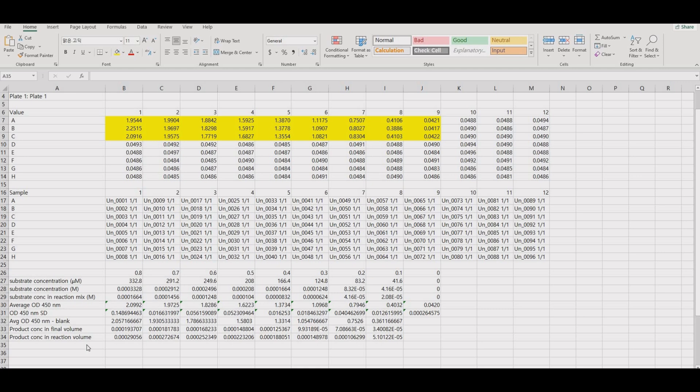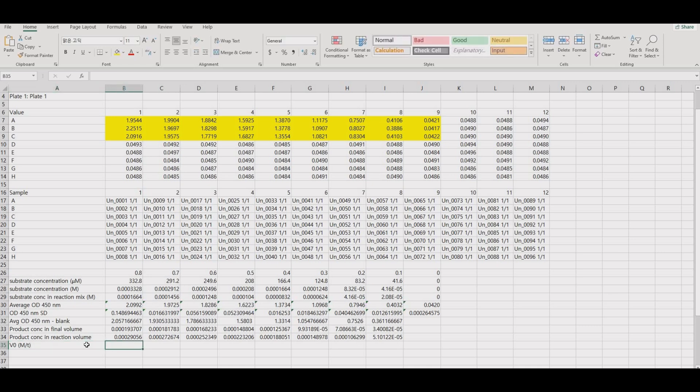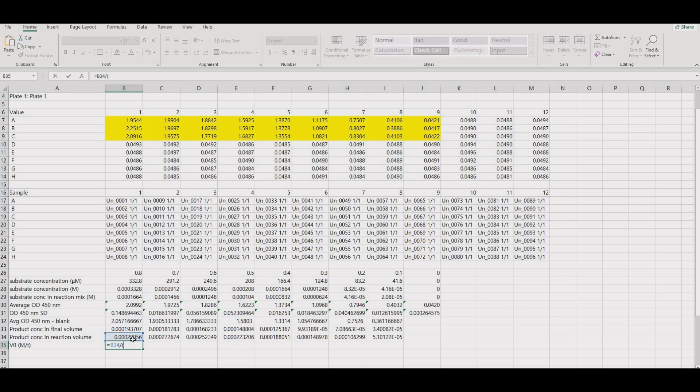Divide the corrected product concentration by time to get V0. We incubated for 10 minutes and so divide by 600 seconds.